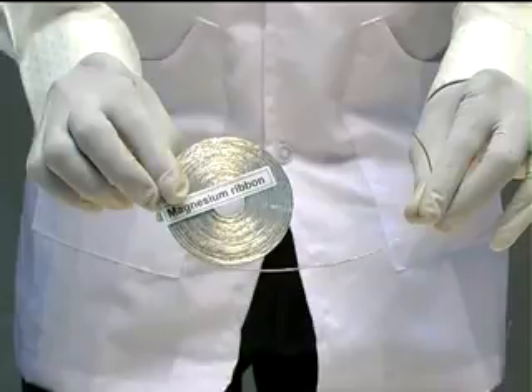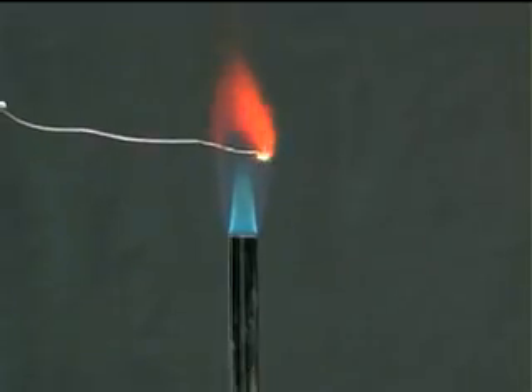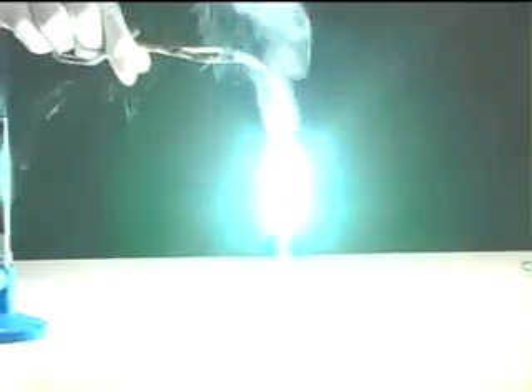Magnesium ribbon is shown here. Magnesium burns very brightly in air with a lot of light and heat, forming magnesium oxide.